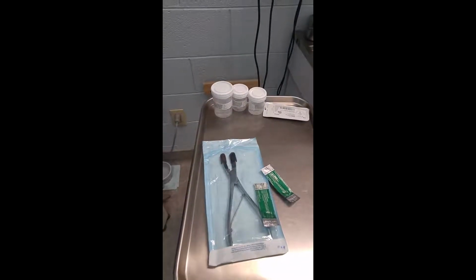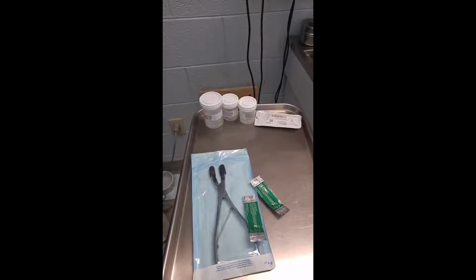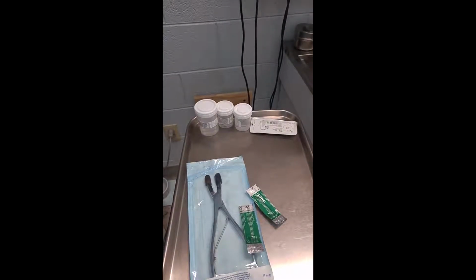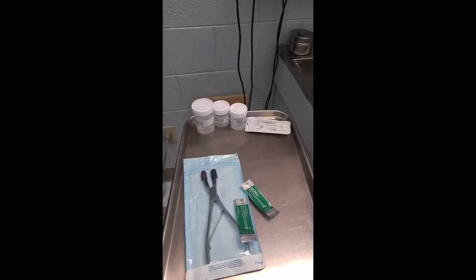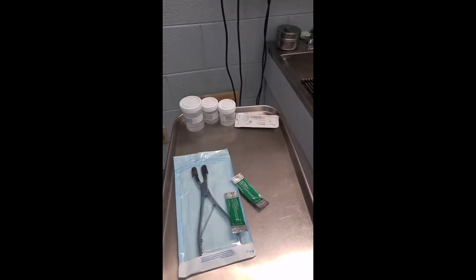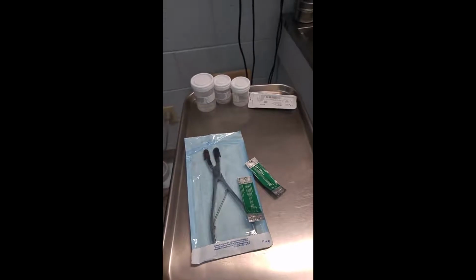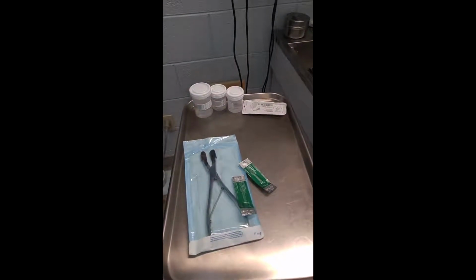Also got a few different sized containers of formalin so that when we take our tissue samples we can put them in there appropriately based on the size and the amount of formalin in the jar. Also has some suture. We've got some blades, and then these are for cutting through some bone so that we can get into the chest cavity.